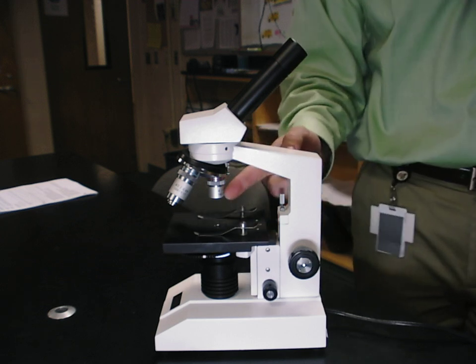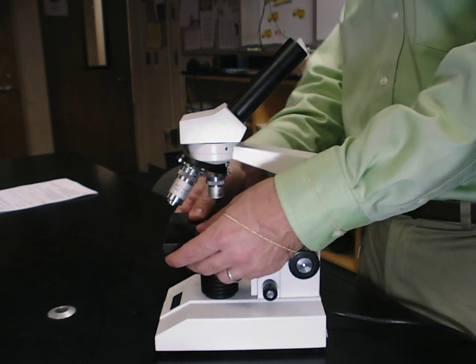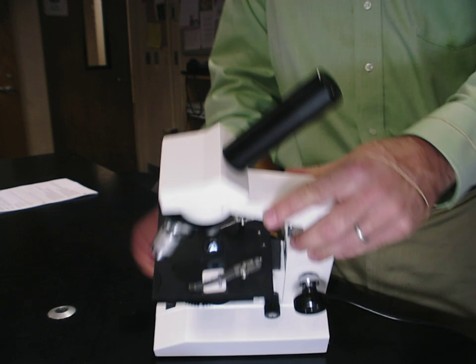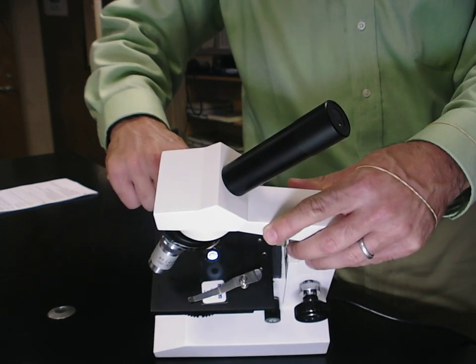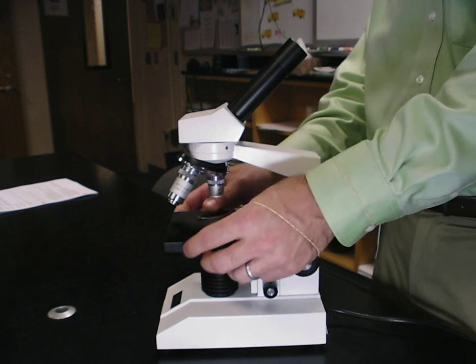You make sure that you are on focusing power or the scanning power. Then you slide the slide underneath the stage clips and you center it so that the piece of cork is right in the center. So the piece of cork is as centered as possible underneath the light.